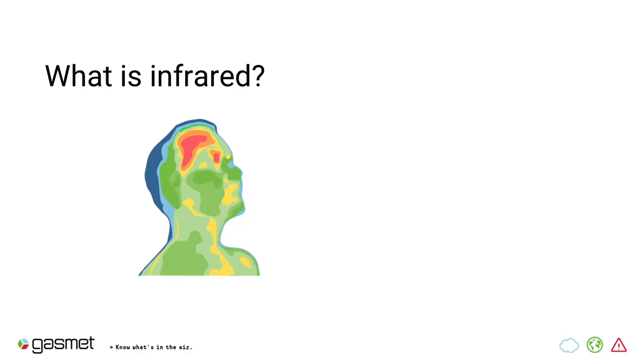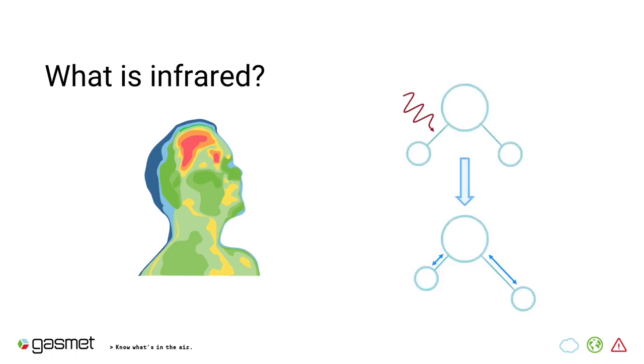It is based on the fact that infrared has this amazing effect of causing vibrations in a molecule. A molecule will absorb IR radiation and begin vibrating the bonds between its atoms. The energy and the wavelength of the radiation required depends on the atoms bonded, the bond type, and the type of vibration. Now, how those affect it is beyond this webinar. For us, it's enough to know that light corresponding to the molecule will be absorbed and other light will just go through.